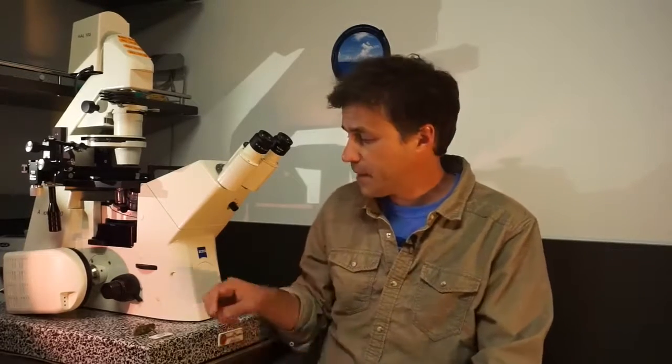My name is Patrick Keeling, and today we're going to do a video with step-by-step instructions to make your own microscope. We use microscopes a lot in my lab, but we're not going to build a complex one like these research microscopes. We're going to build one that's very simple. But it's also very historically interesting because it's a replica of the microscope that was first used by Anton van Leeuwenhoek in the 1600s when he discovered the microbial world.